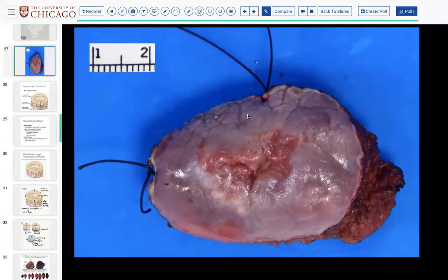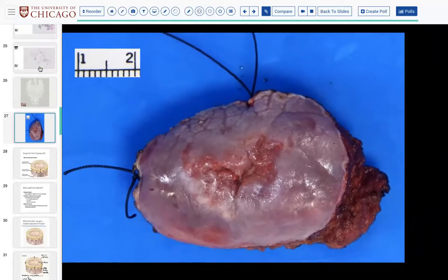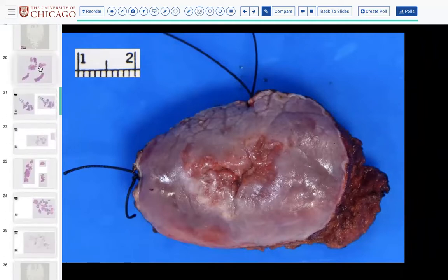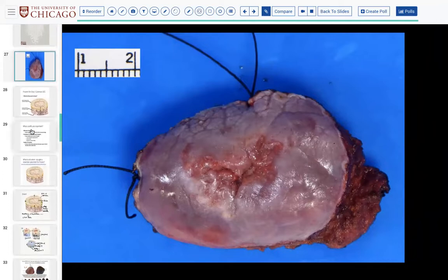All right. So last time for the frozens, we did snippets, little individual biopsies here and there. At the end of this, of course, I'll provide you this full link. But I thought today we would go into more of the case where you're actually dealing with some kind of resection, whether it be the main specimen or bits from around the main specimen or a conglomerate of both.